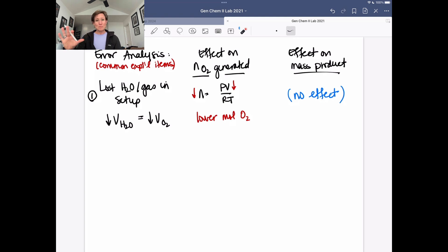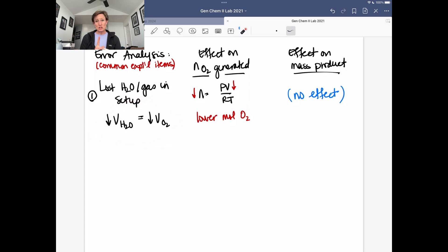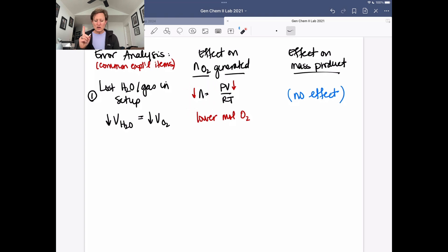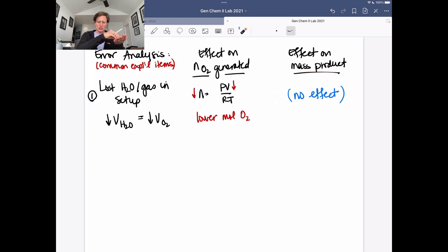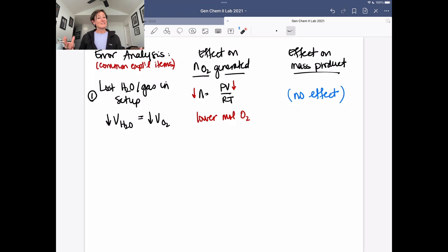The first scenario: your experimental setup had a hole in the tubing, or you lost some water. Losing water is equivalent to losing gas. If we're losing oxygen or water, we're not measuring or capturing as much oxygen. If we decrease the volume measured, that results in a lower number of moles of oxygen. However, there should be no effect on the mass of product made, because the potassium chlorate is still converting to its solid product — we're just losing some of the gaseous byproduct.